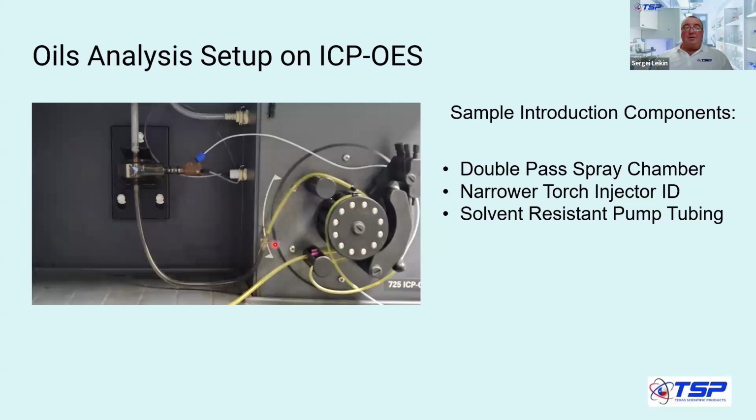The other thing special about running oils or any organics is you need to use a narrow injector torch, injector ID, because when samples are diluted in solvent, even in a basic solvent, not a very volatile one like xylene or toluene.